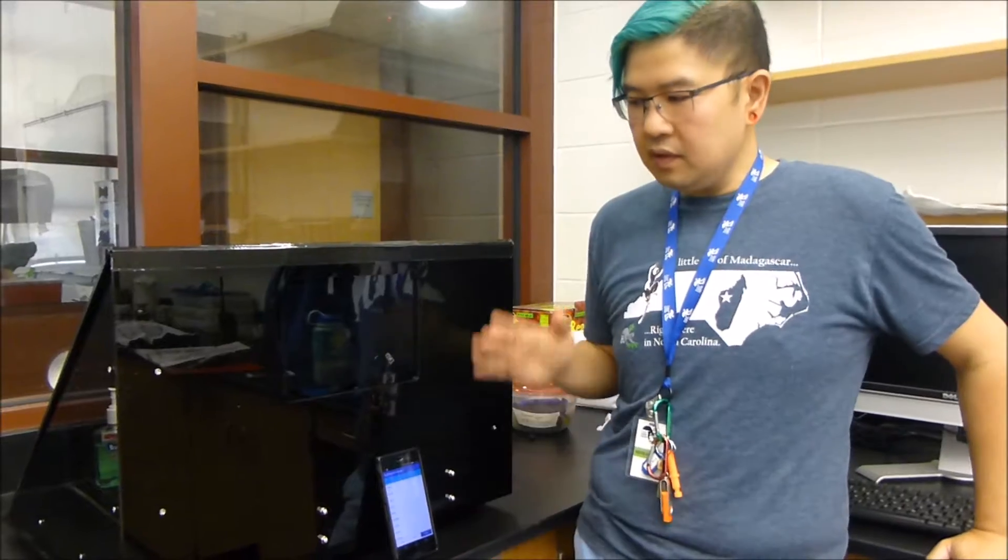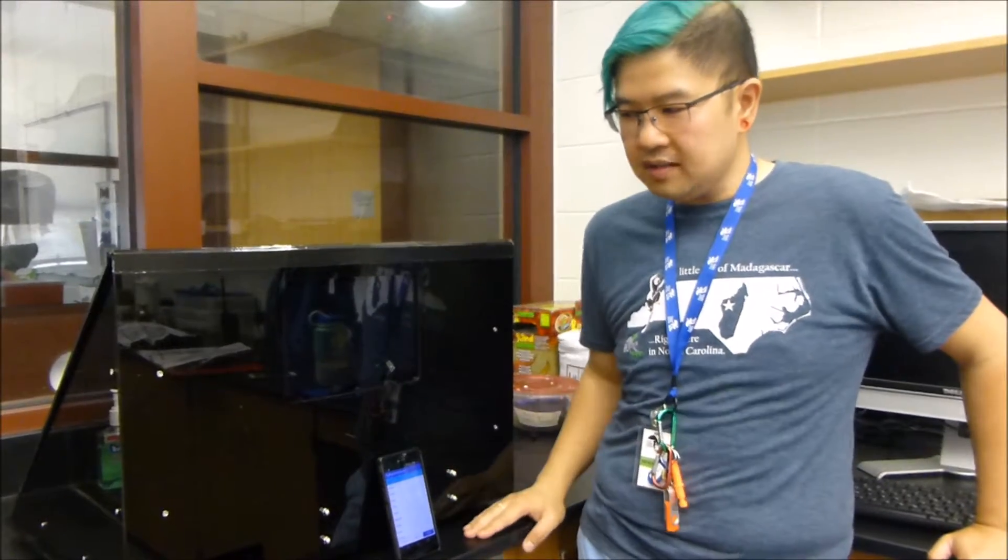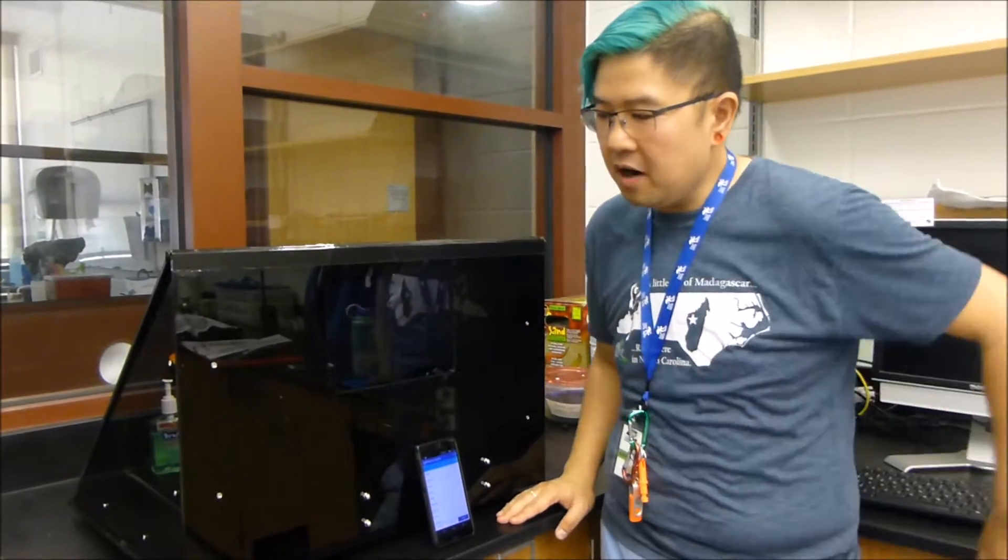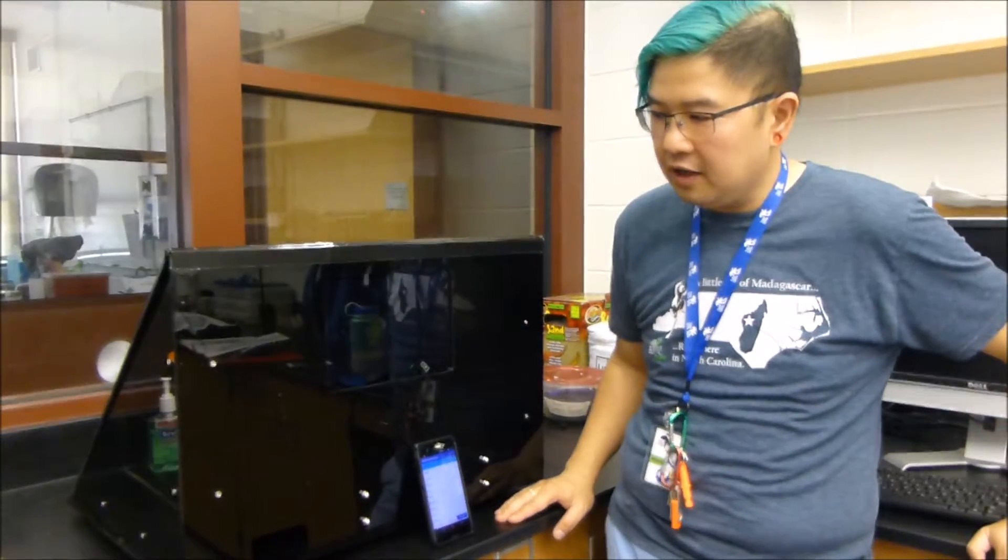So let's look at testing sessions. For a testing session, everything is automatic. You just need to initiate the testing session, and Smarga would do everything automatically.